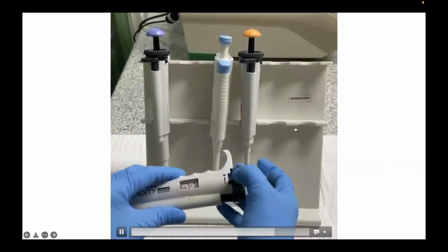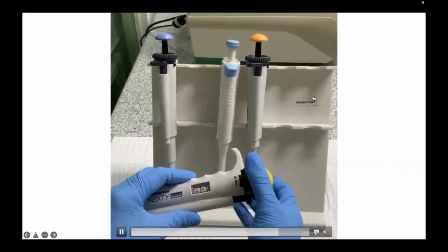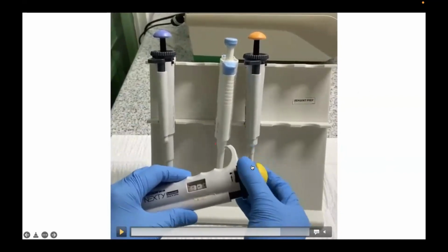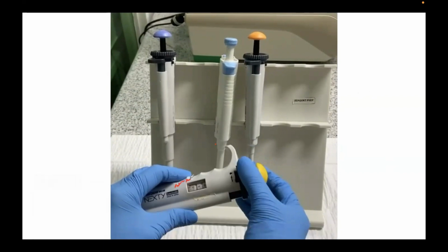So, pagtapos na tayong gumamit ng ating micropipettes, bukod sa ilalagay natin siya sa isang pipette stand, dapat i-adjust natin siya sa kanyang maximum volume. For example, itong inyong micropipette na yan, meron siyang volume na 100 to 1,000 UL. Since adjustable siya, dapat po ibabalik natin siya sa 1,000 UL, yung kanyang maximum capacity. And then balik mo na siya doon. Para daw po hindi masira yung kanyang spring at hindi maapektuhan yung kanyang accuracy, sabi po ng mga ahente at sabi sa ating turo. Ayan, ganyan po yung tamang pag-aalaga ng ating mga micropipettes.